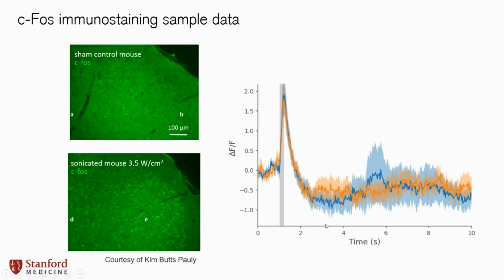One of the reasons I wouldn't recommend it is because in a lot of my work, depending on what cell types you're looking at, so here on the right is GCaMP imaging from a set of cells in the thalamus, and the ultrasound comes on at the gray bar here. You can see that you get this fast excitation in these neurons. So you're getting an increase in activity that normally you'd say, oh, okay, then I should get c-Fos, right?